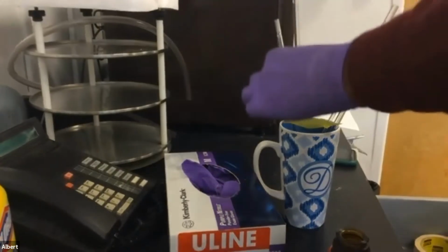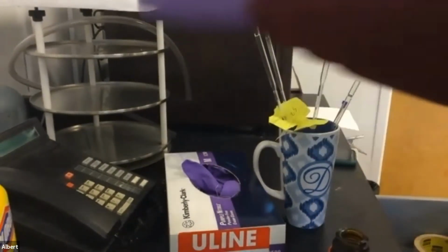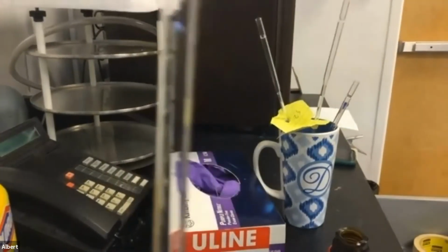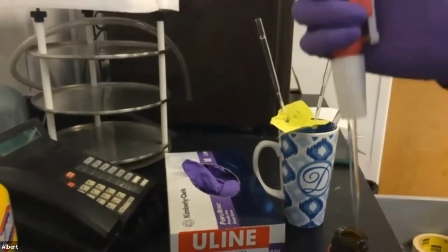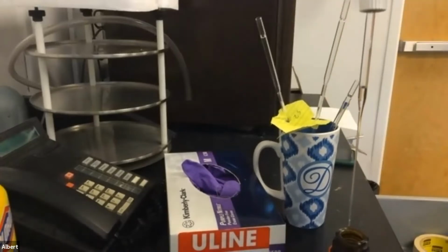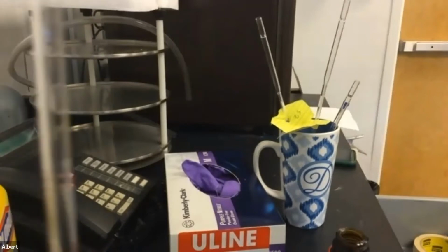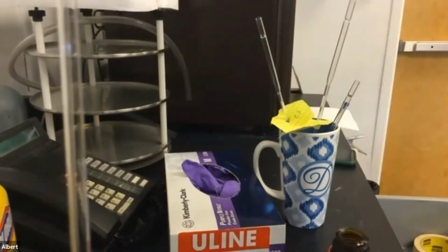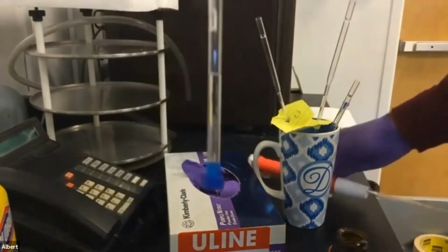And then I'm going to take the crude sample 1. Sample 1 is already falling out of the pipette, so that's great. I just need to add some solvent to it. I'm just going to add that right into the pipette. So whenever you transfer in a solid, this is the easiest way to do it. It's just to use a pipette, put some in the tip, and then put the solvent through the pipette.